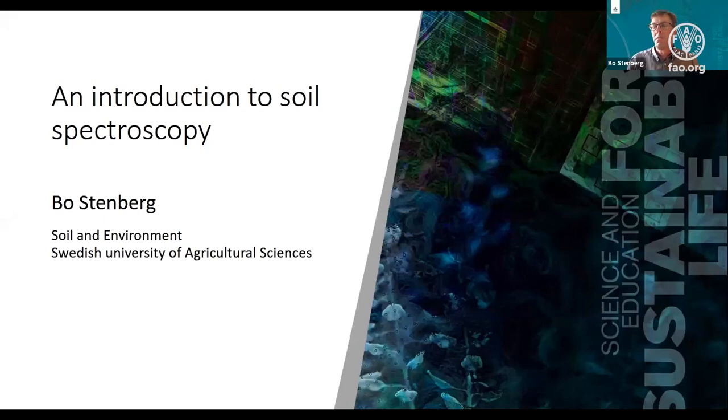And thank you for the opportunity to give this seminar about soil spectroscopy. This one is the first of a series, as you heard, and it will be mostly an introduction to soil spectroscopy. But at the end, if the time doesn't fly too fast, there will also be an example where we use a National Soil Spectral Library to map soils at the field or farm scale, because my interest in near-infrared spectroscopy is as a fast, simple and cheap method to get the high density information about soils that we need for precision agriculture.